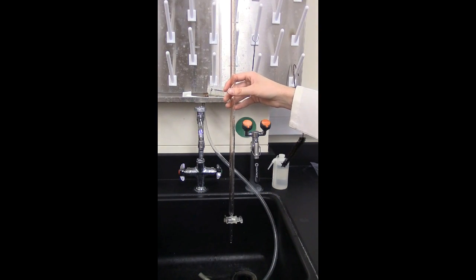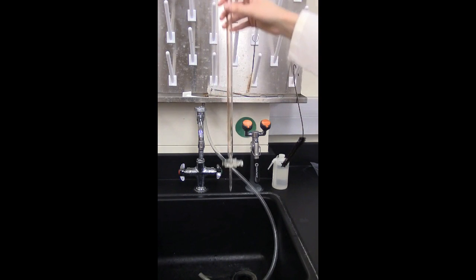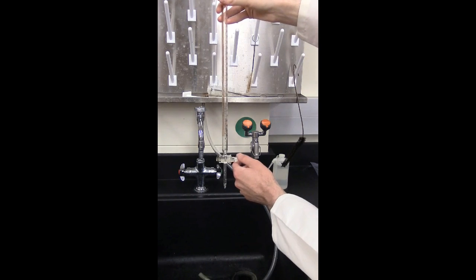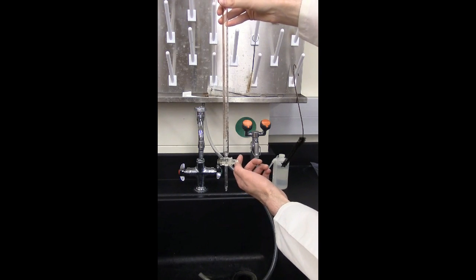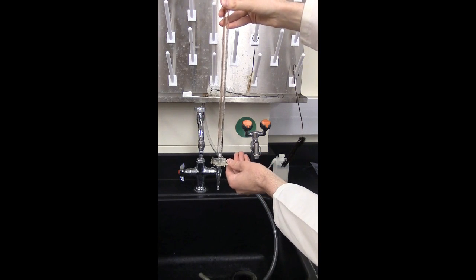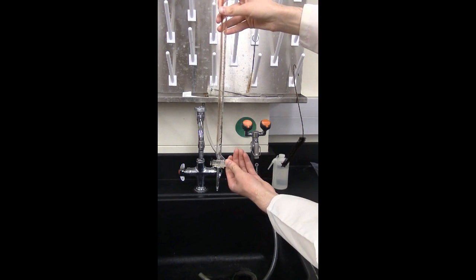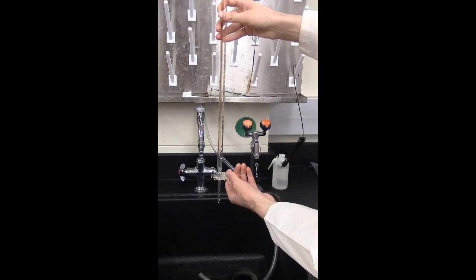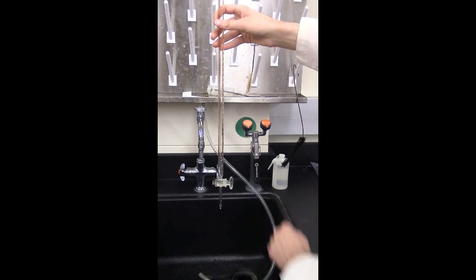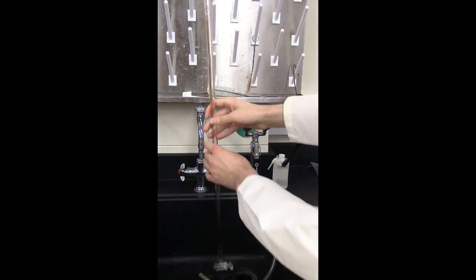Now we're ready to pour in our substance into the buret. Before we do that though, notice the position of the stopcock. It is in the horizontal position. That means it's closed. If it's vertical, it's open. And you don't want it open while you're filling up your substance. Otherwise, everything's going to just start pouring out. So make sure it's closed before you start filling it up.